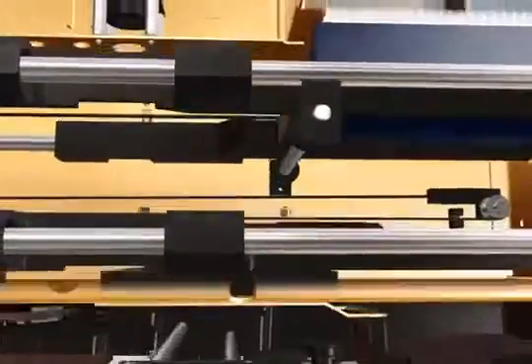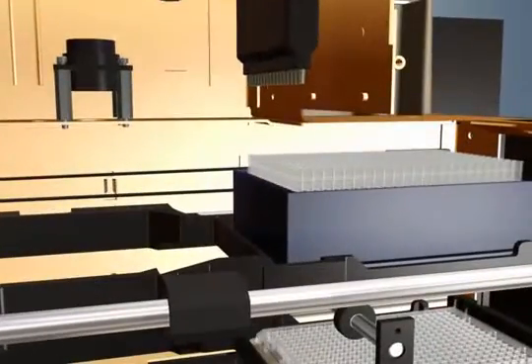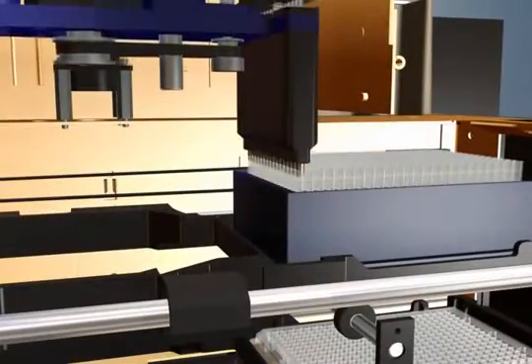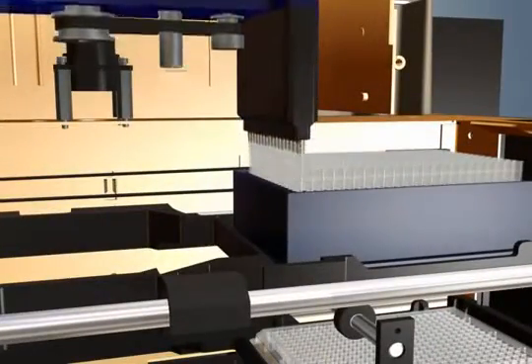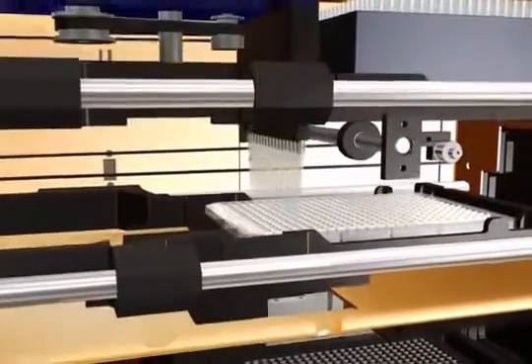Using the FlexRead feature, the assay plate is read from the bottom to obtain the baseline signal while the pipetter head loads tips from the tip drawer and aspirates compounds.